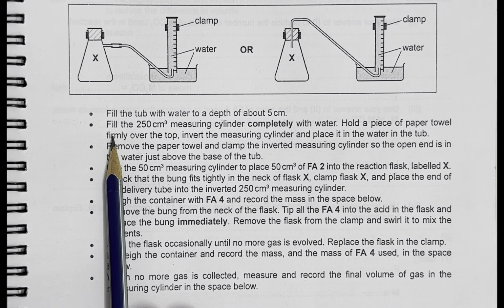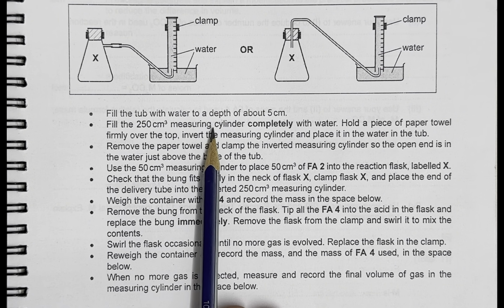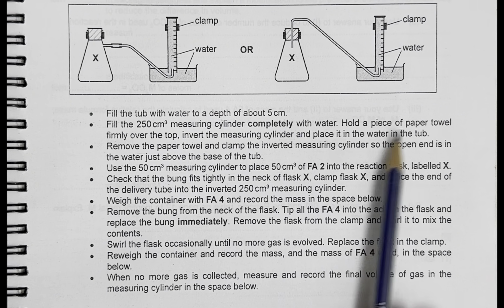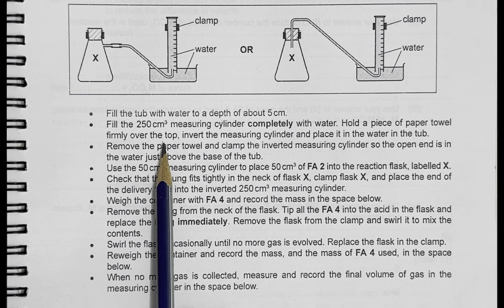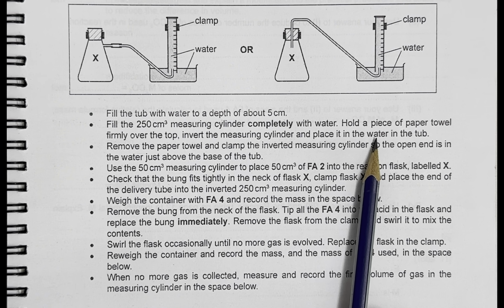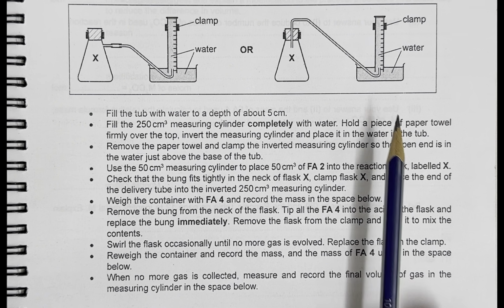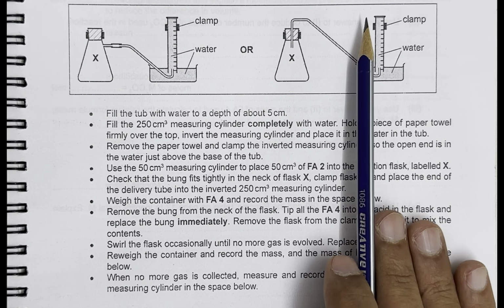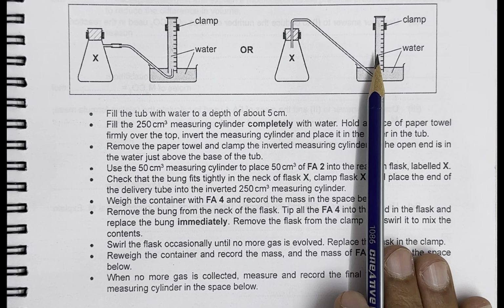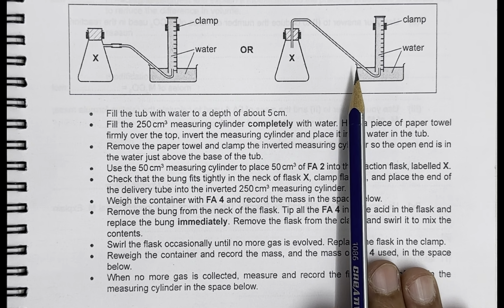Then fill the 250 centimeter cube measuring cylinder completely with water. Hold a piece of paper towel firmly over the top. Invert the measuring cylinder and place it in the water in the tub. So here we can see that this measuring cylinder is filled and inverted and then placed in this water bath.